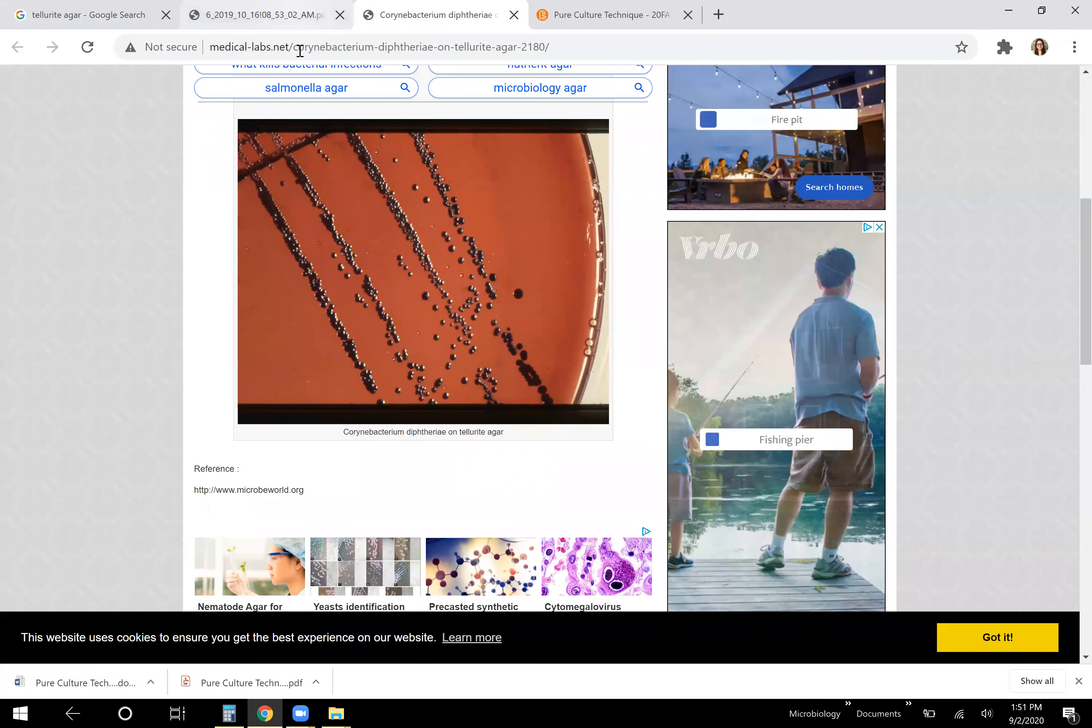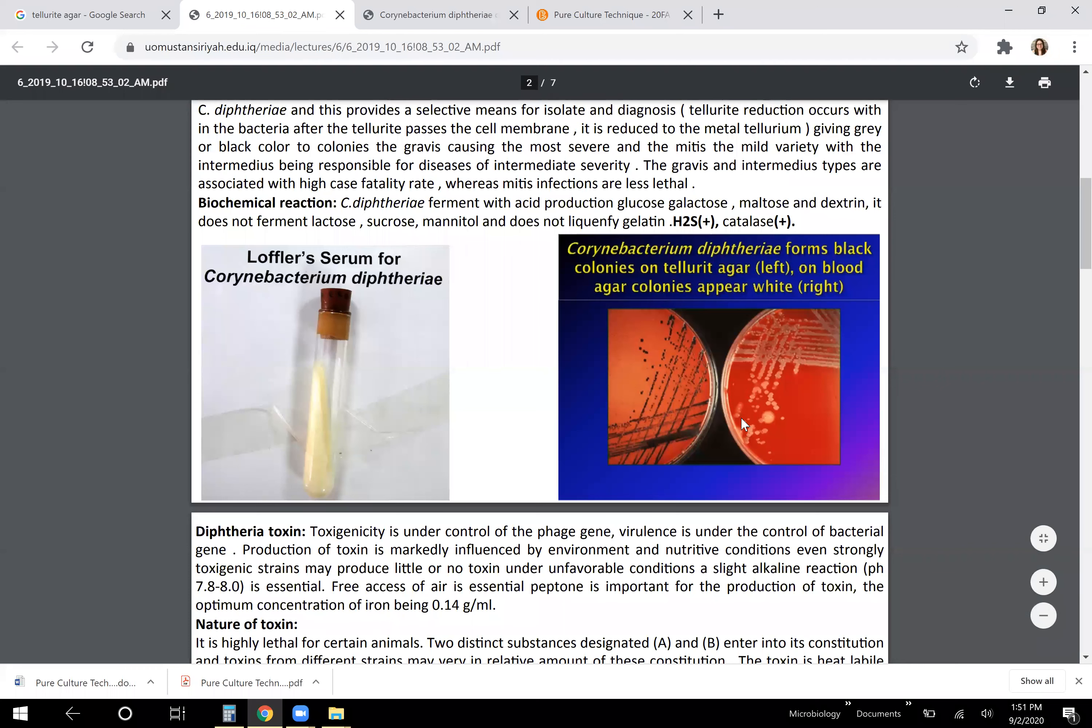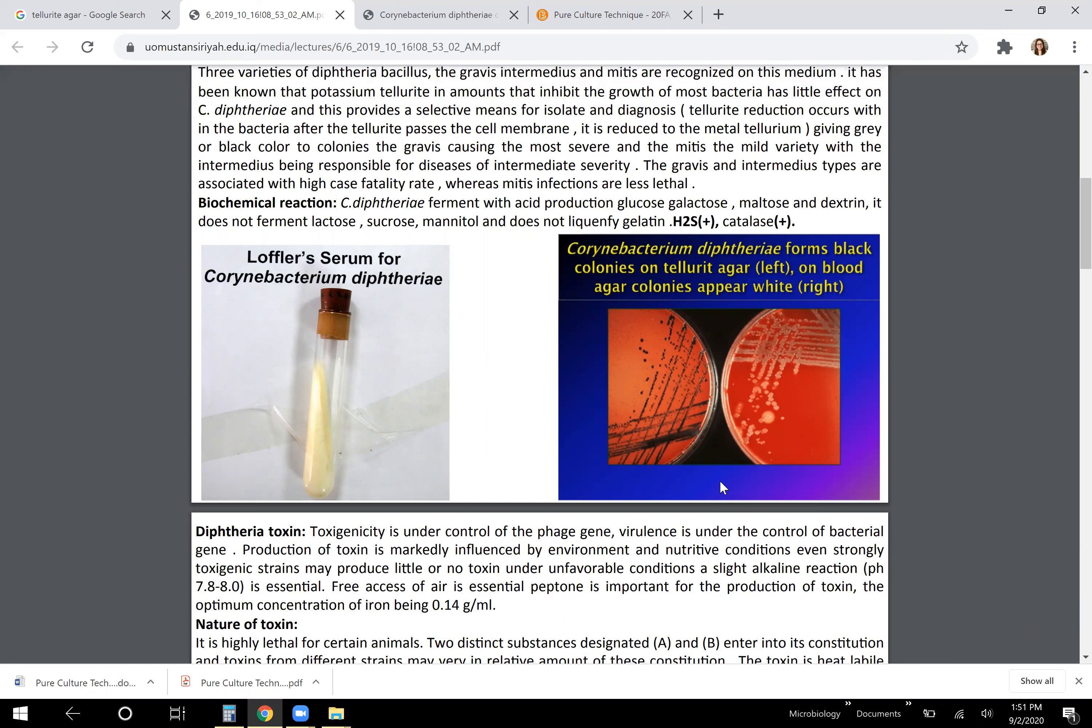So if you look at this picture, there is a comparison between tellurite agar on the left and blood agar on the right, which even though they both have a red background and look similar, the white colonies are on the blood agar because there's no tellurite crystals in there that would cause the bacteria to take on that black color.